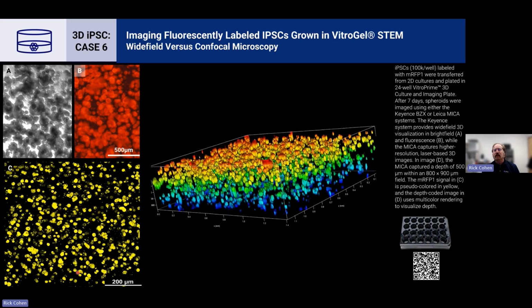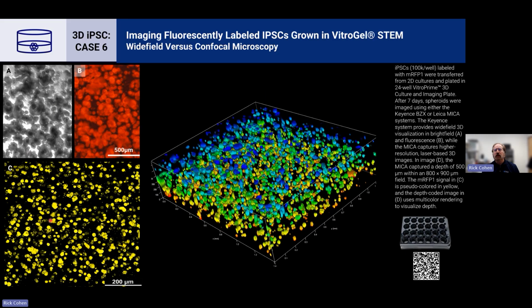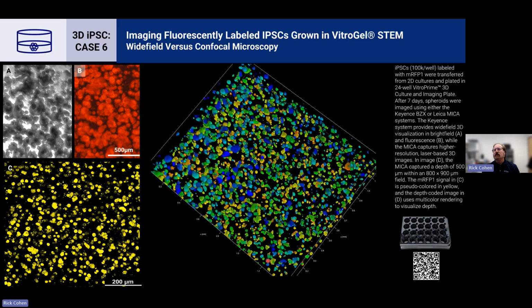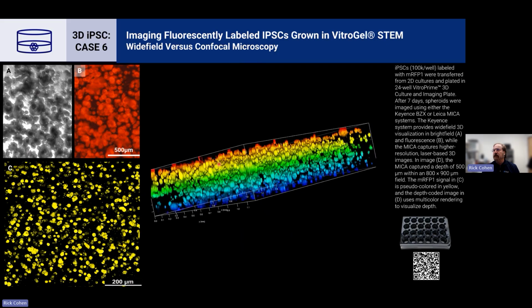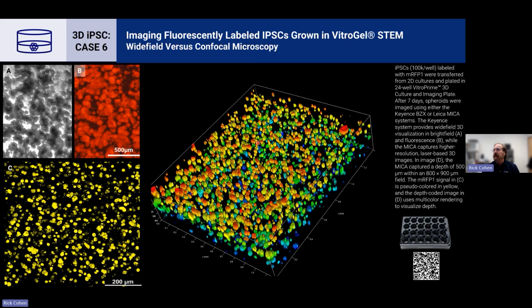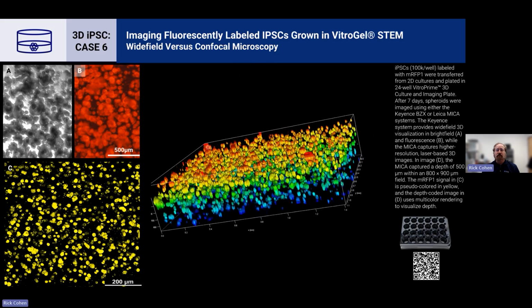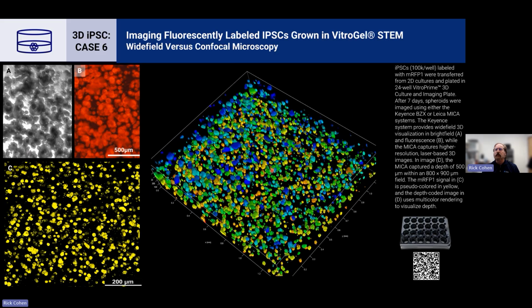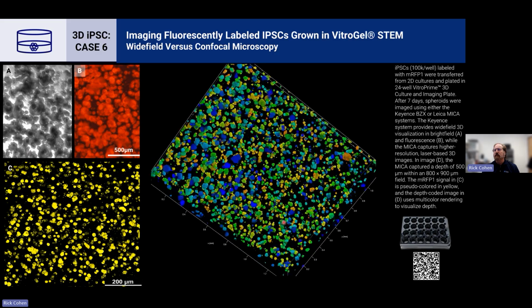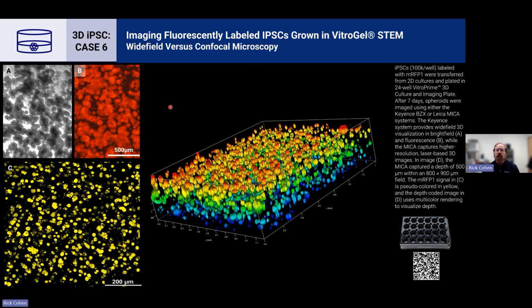So using a similar well, we took some pictures with the confocal and then rendered this so you can see that there's many layers. So this is 500 microns, tiled 800 by 900 micron field. And the red fluorescence is eminently visible in all those layers. So we can visualize fluorescent proteins.